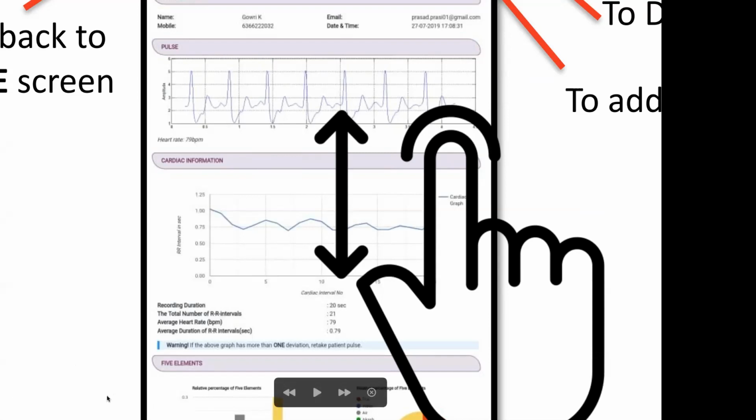I also had the same doubt about this deviation, because in most of my cases, it is written at the bottom that there is more than one deviation and you have to repeat the graph. This type of deviation, nothing to worry. A deviation is nothing but too many spikes. You will get that only when you vary the pressure. Right, sir. Okay, thank you.